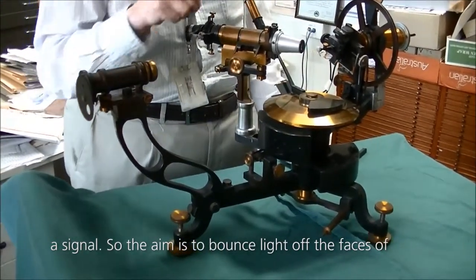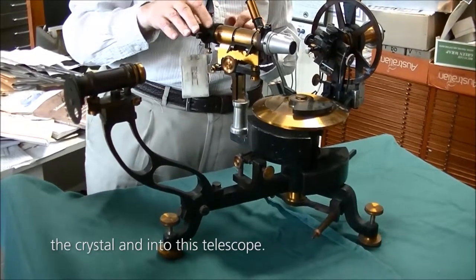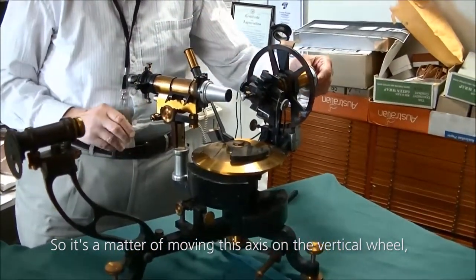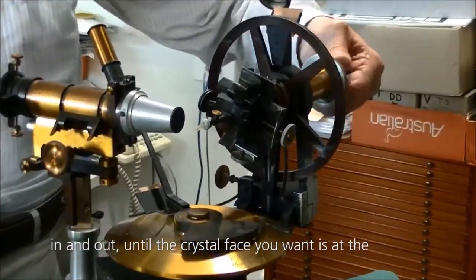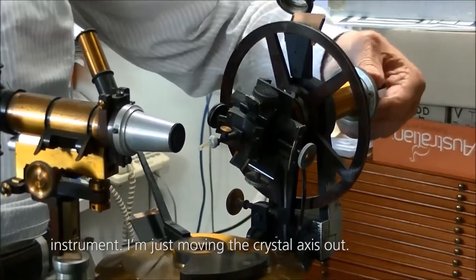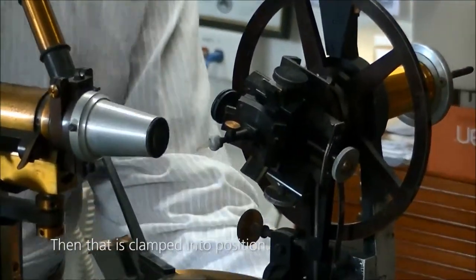The aim is to bounce light off the faces of the crystal and into this telescope. It's a matter of moving this axis on the vertical wheel in and out until the crystal face you want is at the intersection of the horizontal and vertical axis of the instrument. I'm just moving the crystal axis out, and then that is clamped into position.